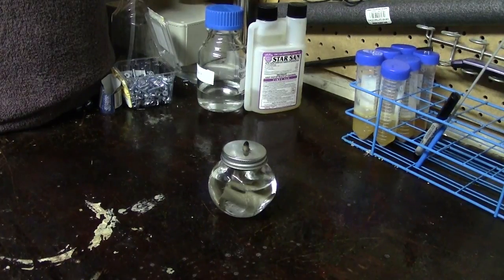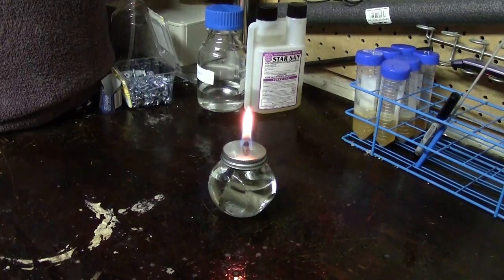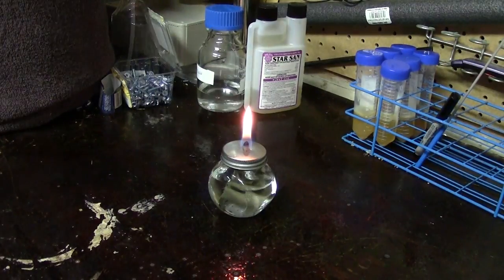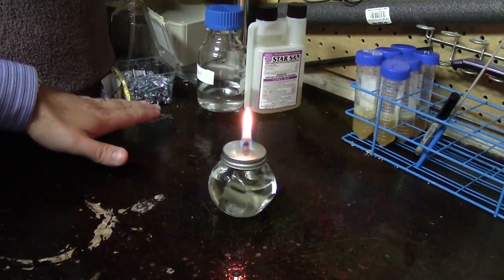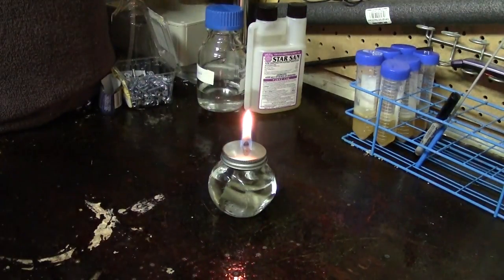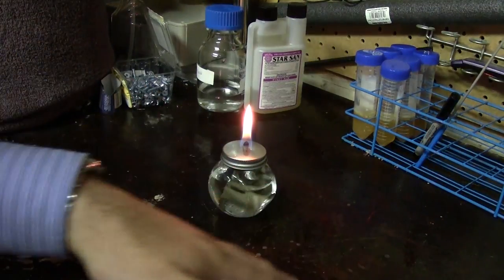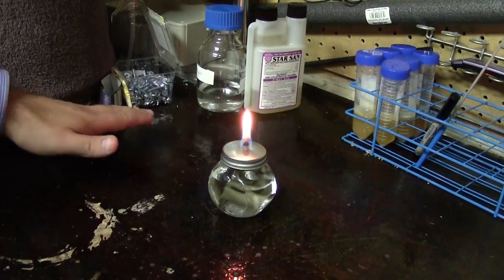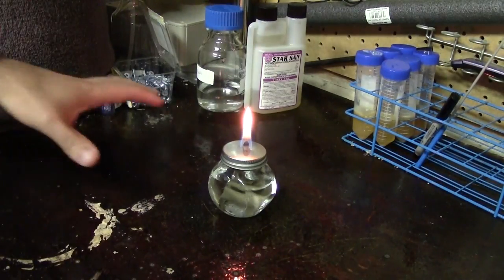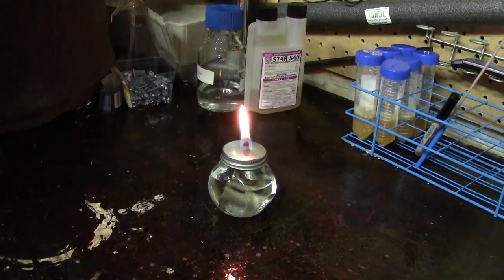One of the most important parts of aseptic techniques is working properly with your flame, be it a Bunsen burner or an alcohol lamp. The idea of the flame is that it draws air across the bench, which rises in a column and spills out over the top. This creates an area right around the flame where you have air moving upwards — and this is your safe work area, because those upward-moving air currents protect against any downward-falling bacteria or dust.